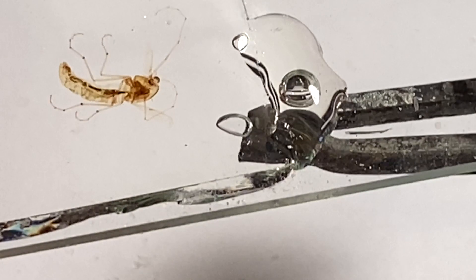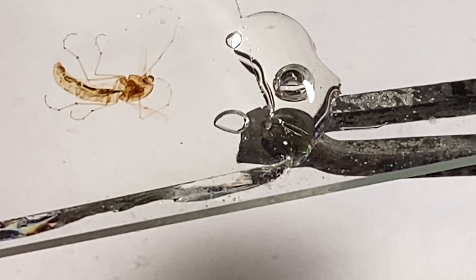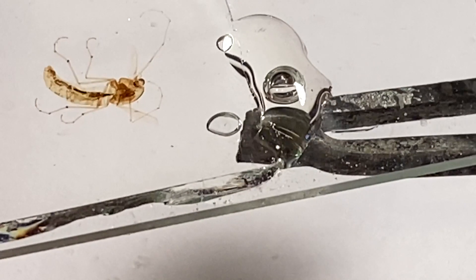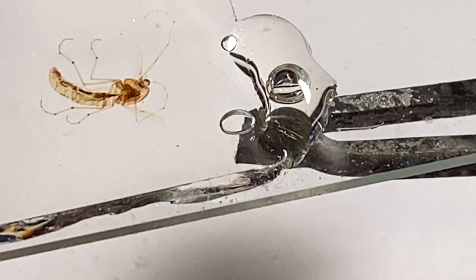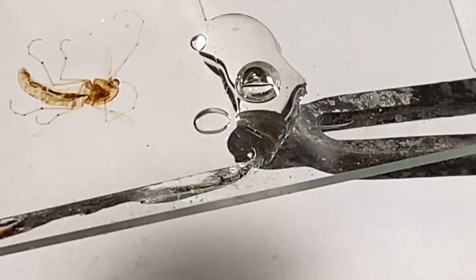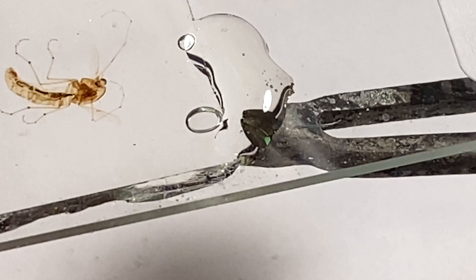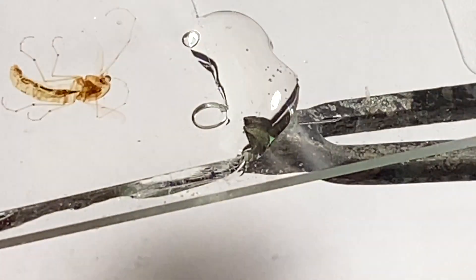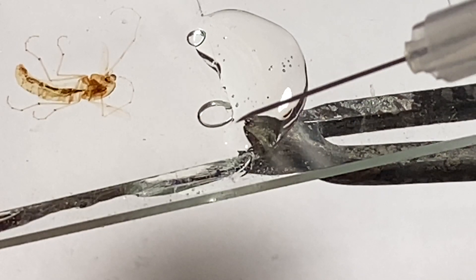There it goes, there it goes, there it goes. Now, you don't want to boil it — you do not want to boil it. See how bubbles are showing up over here? You don't want that to happen underneath.